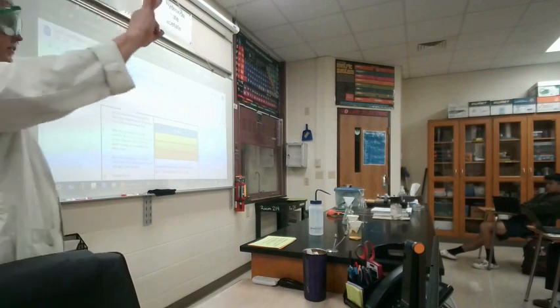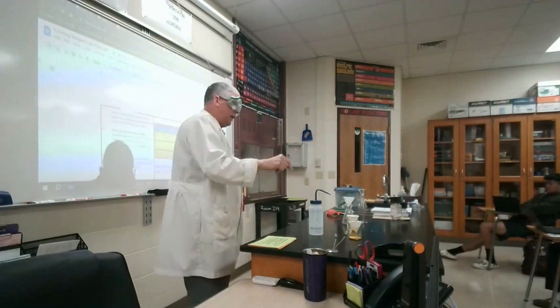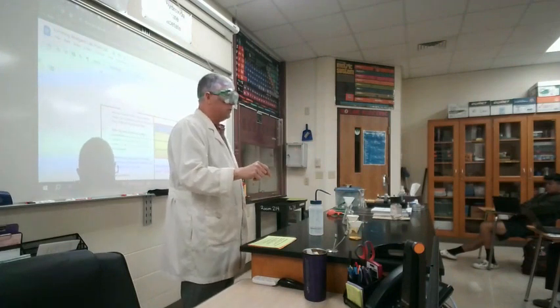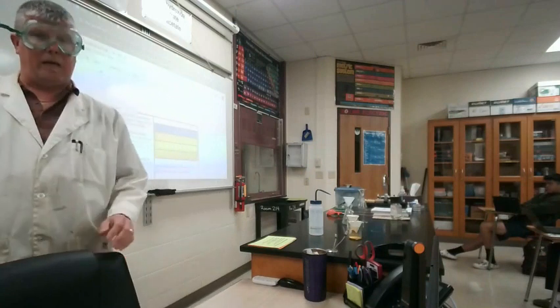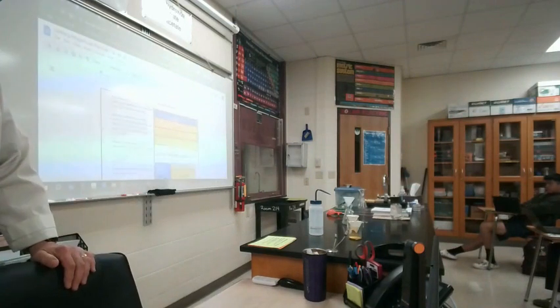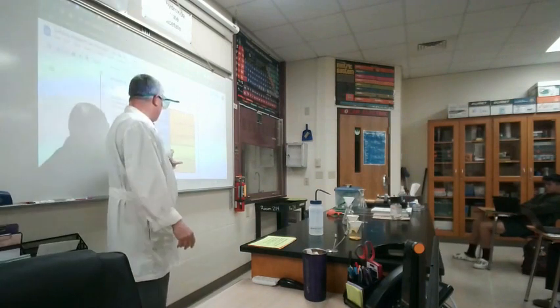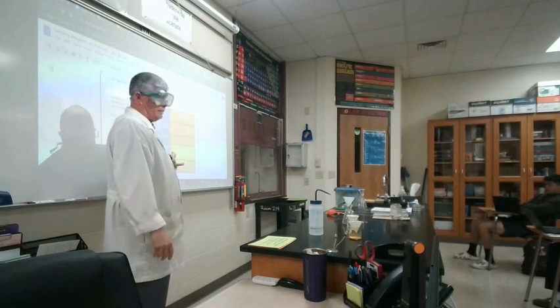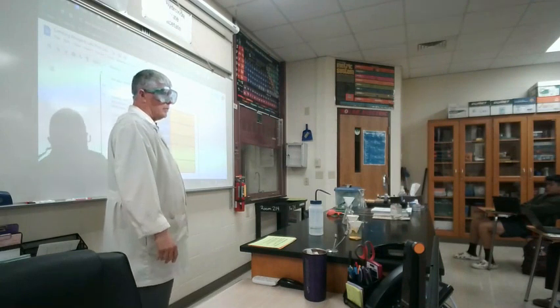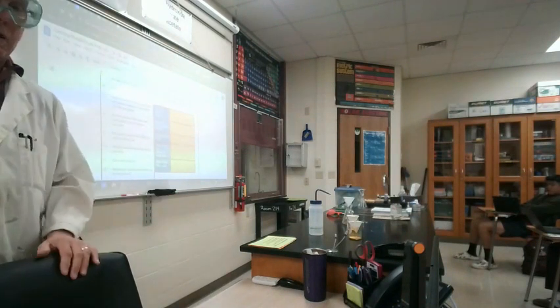Again, three observations minimum. Tomorrow, after you mass it, you can touch the stuff. Okay? But not until then. And please make sure you get all the quantitative data except for these last two, which you cannot get today. Questions? Yes. Okay, I don't have any right now, so hold on.